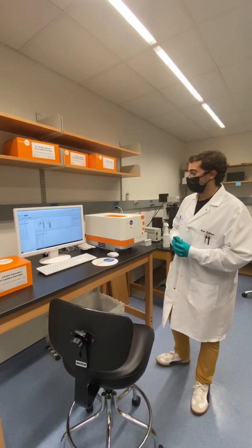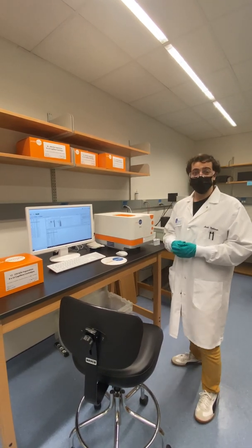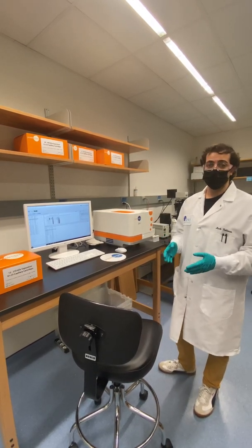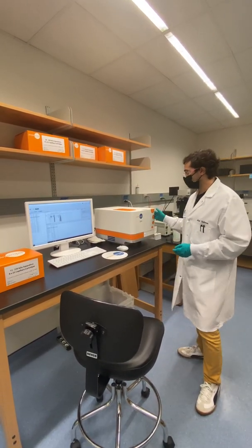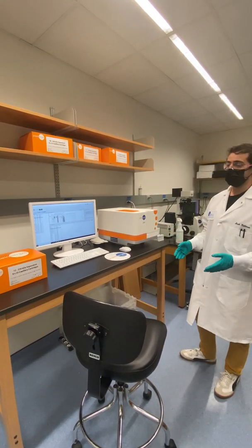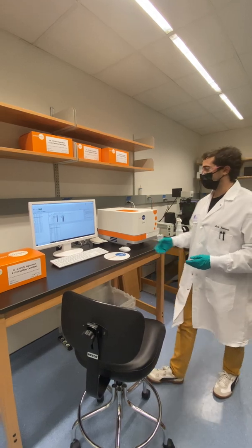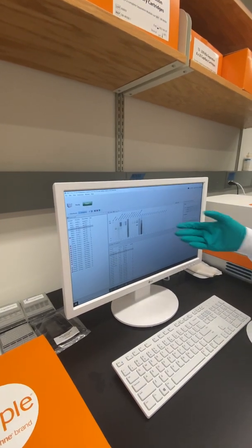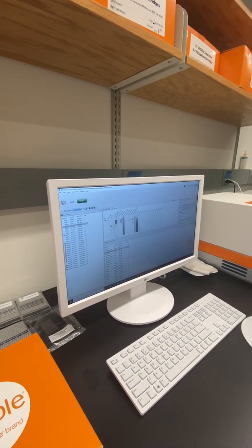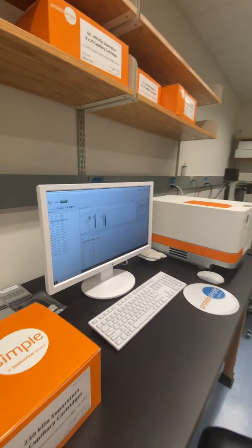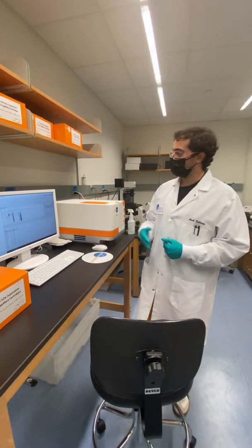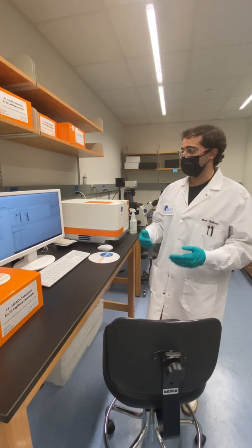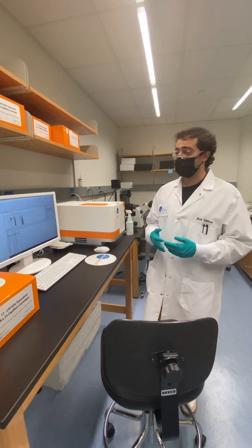Once we have promising constructs that we want to test and characterize, we use different types of machines to characterize them in different ways. This, for example, is called Protein Simple, and this machine is used to do Western blots. There's an example here of one of the recent runs that was done. This was trying to take a look at one of the recent constructs that we're working with, which is the Delta variant for COVID. We were looking for S protein expression within the variant to make sure that everything we wanted to be there was there.